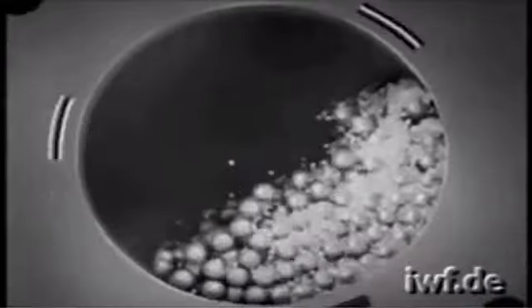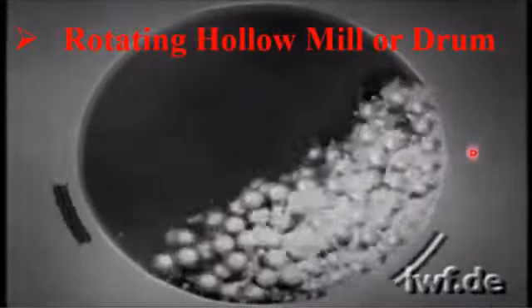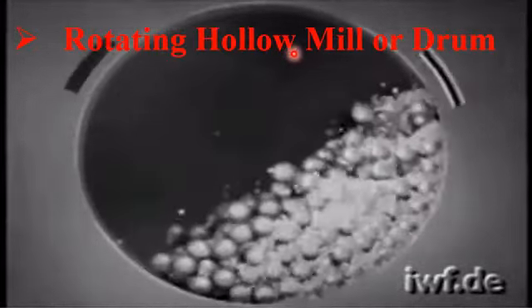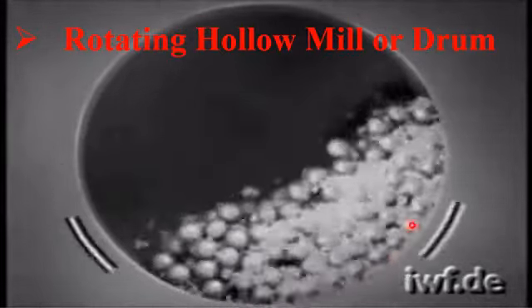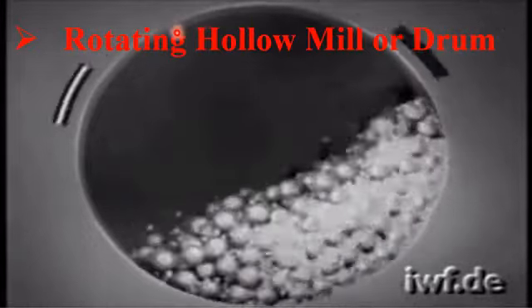Students, please note that a ball milling machine consists of a rotating hollow mill or a drum. So this machine consists of a drum, and this drum is usually hollow or empty.